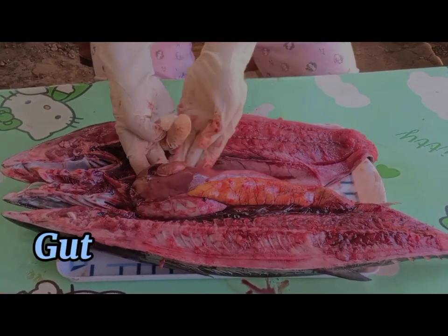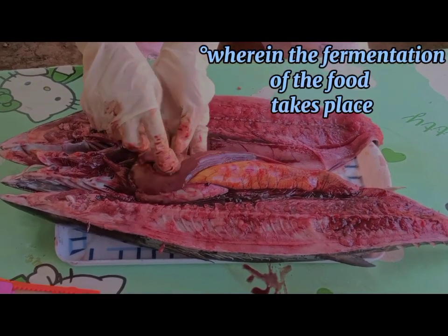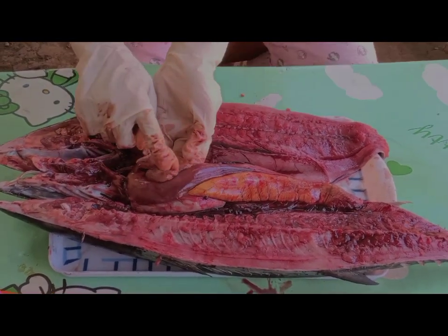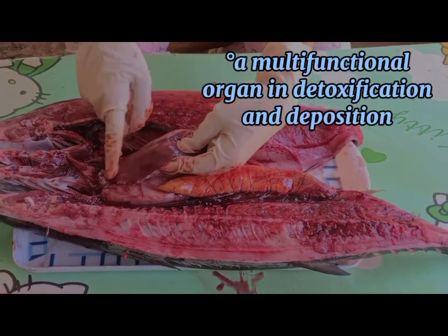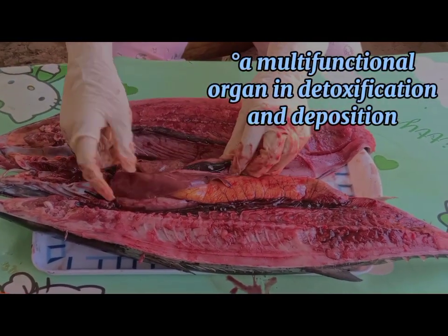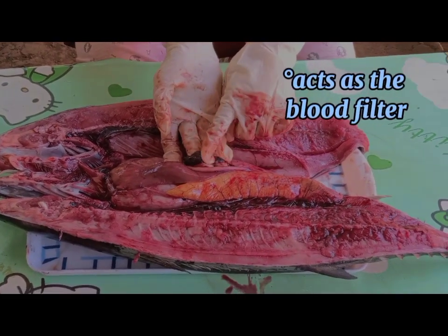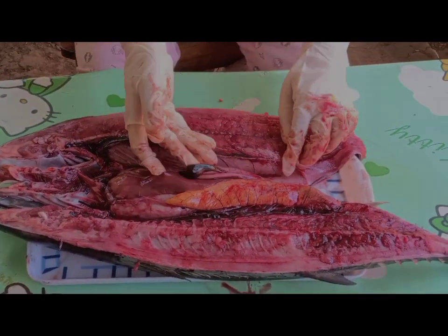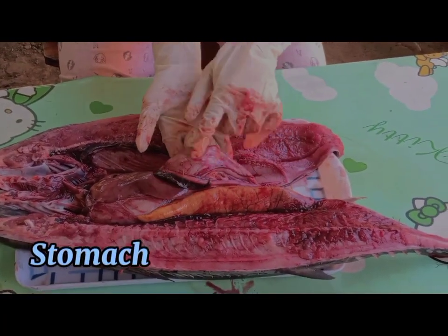Next, the gut — this is the gut. The liver. The spleen — this is the spleen. And stomach — this is the stomach.